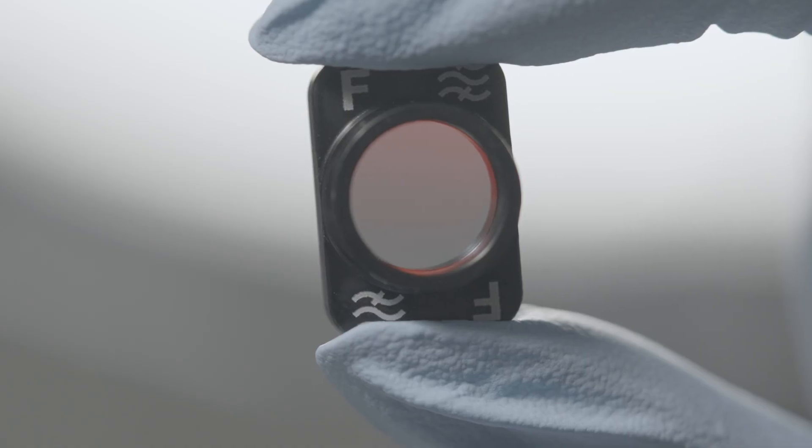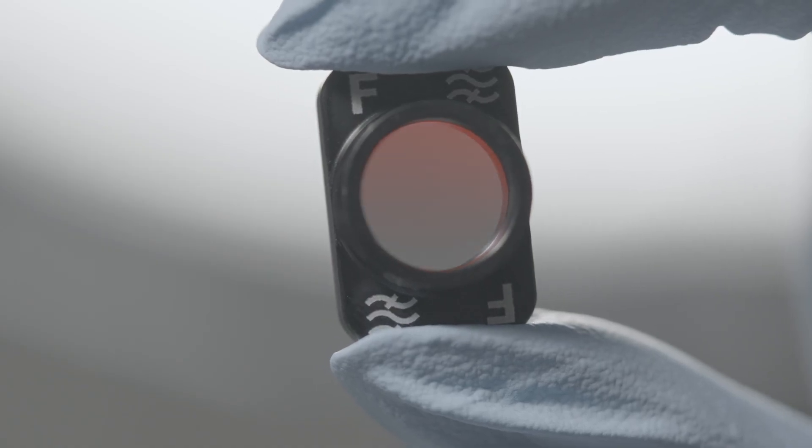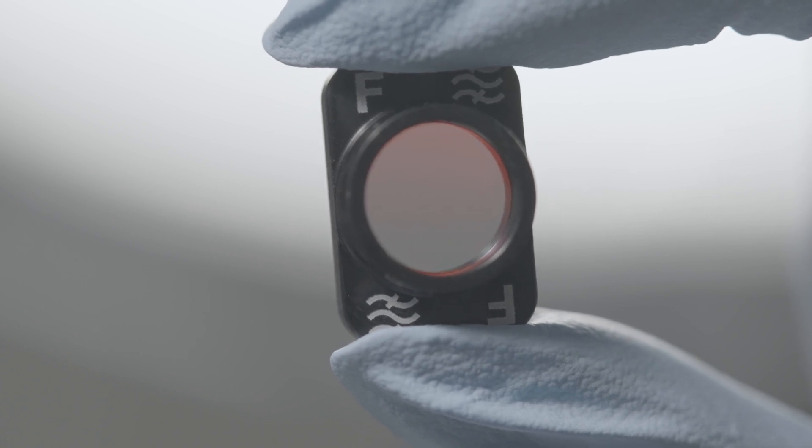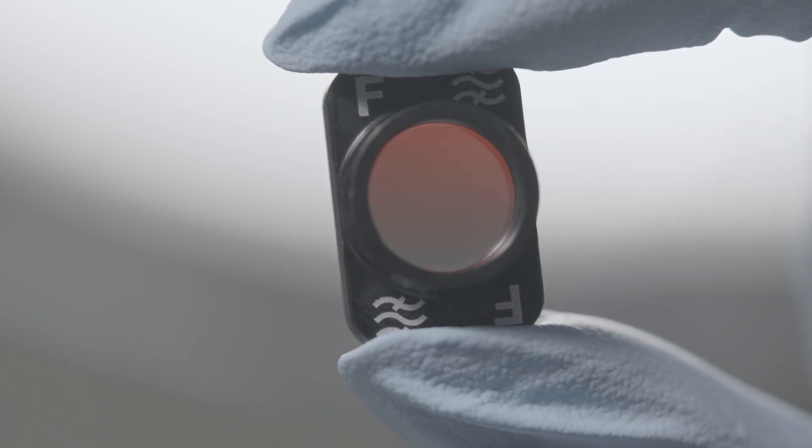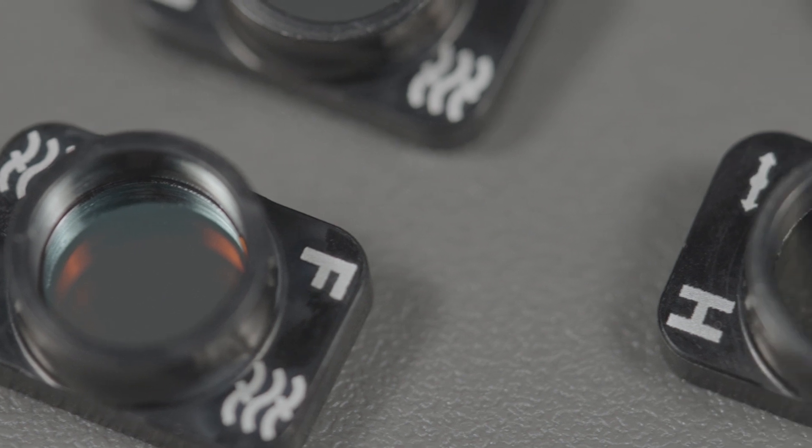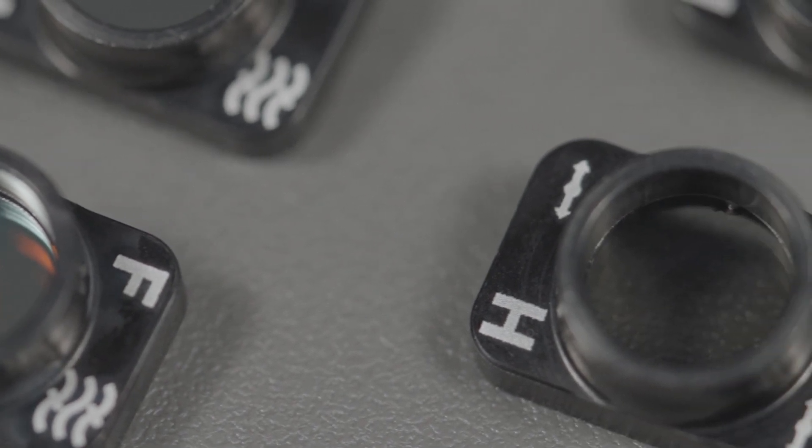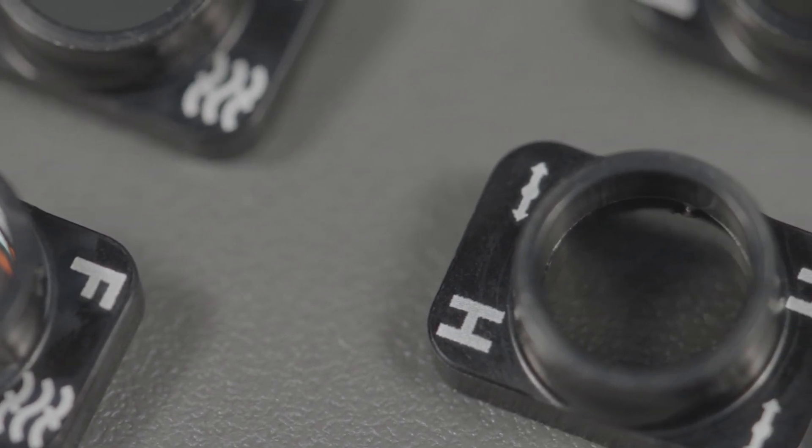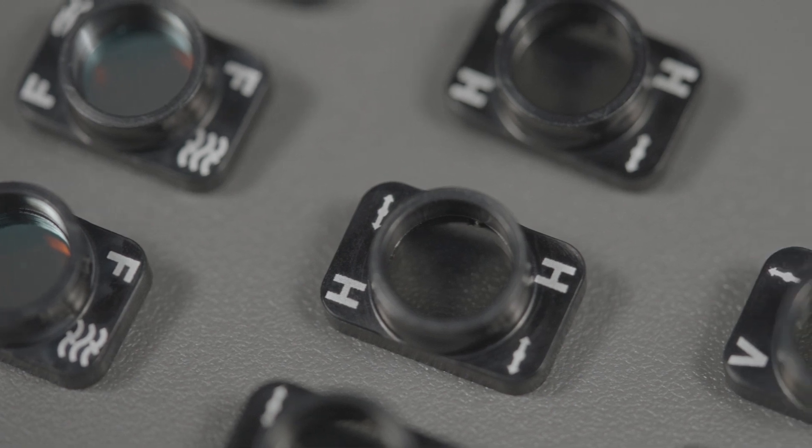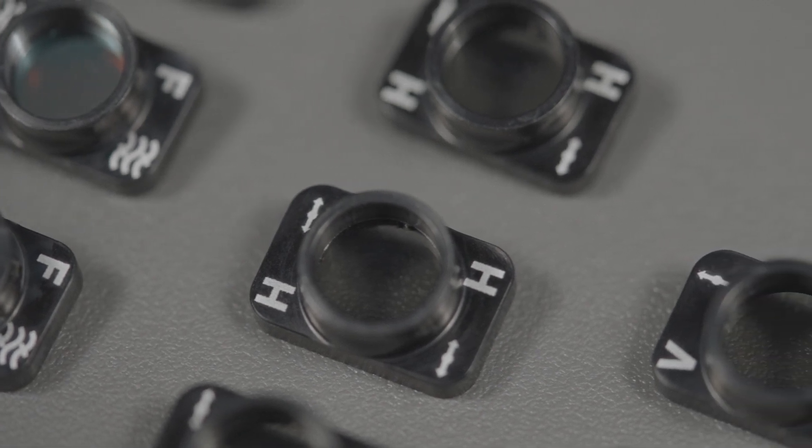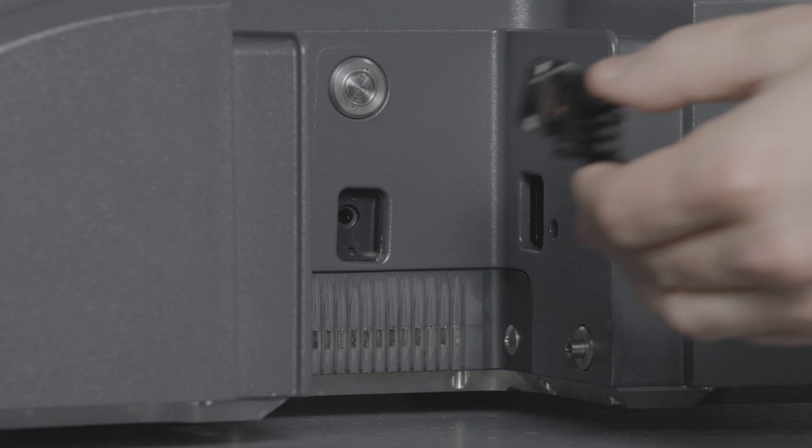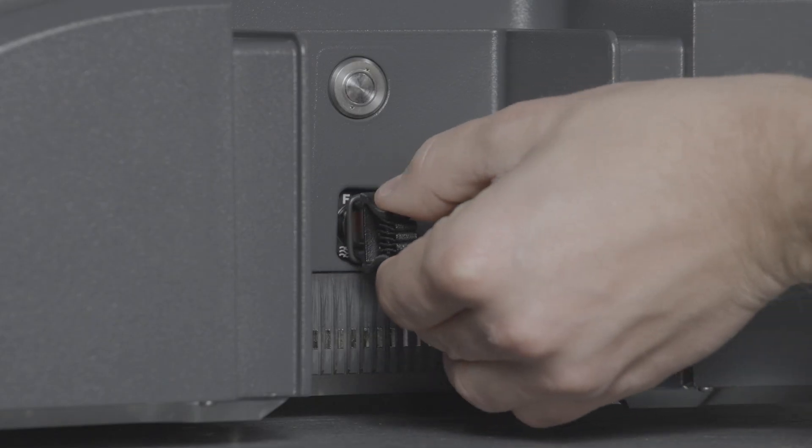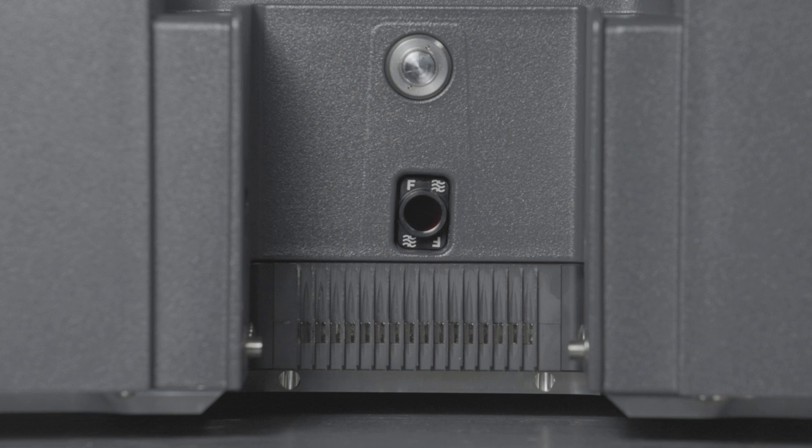LightSizer DLS 501 and 701 offer the possibility to use optical filters. A fluorescence filter, vertical and horizontal polarizers are available. The filters can be inserted for all three angles and must be selected in the measurement parameters before starting a measurement.